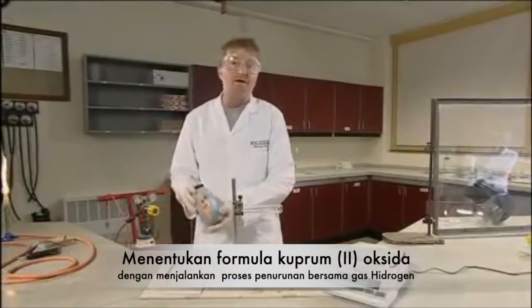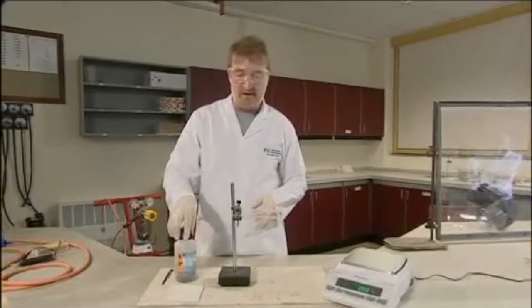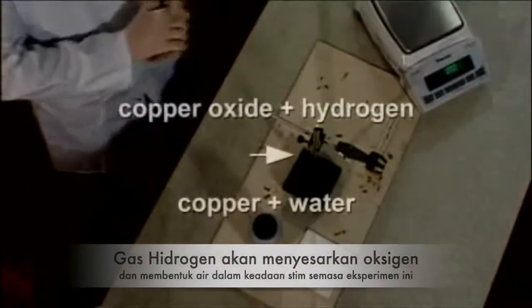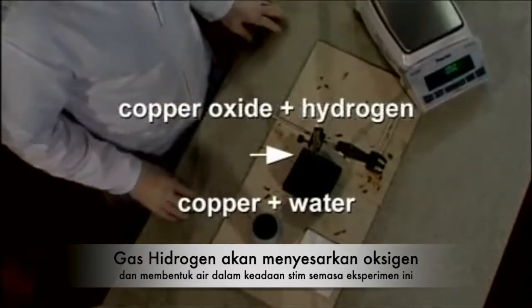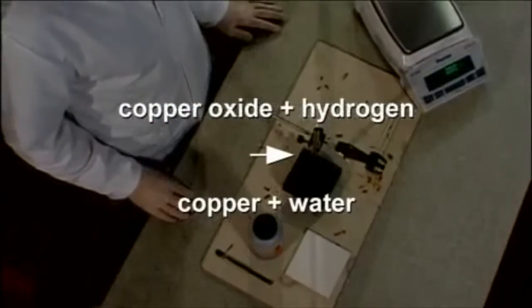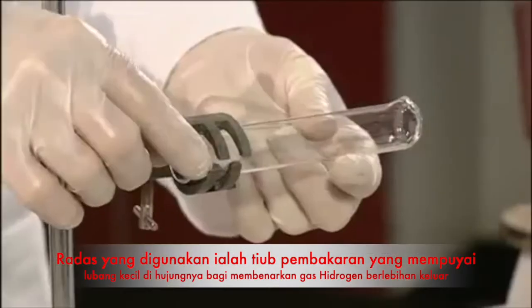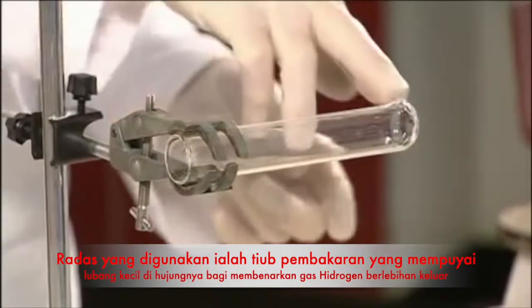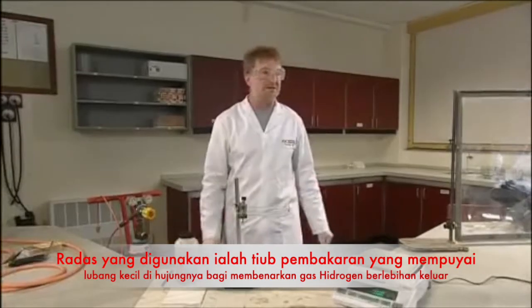Enables us to find the formula of copper oxide by reducing it in a stream of hydrogen. The hydrogen removes the oxygen and forms water, which will be steam at the temperature of the experiment. This is the apparatus we use, a Pyrex reduction tube, which is essentially a boiling tube with a small hole in the end to allow excess hydrogen to escape.